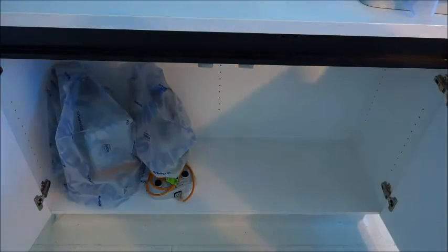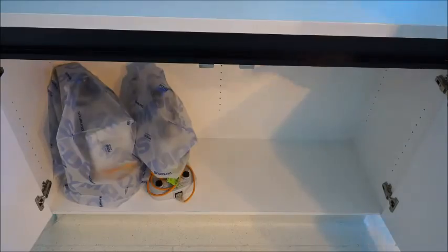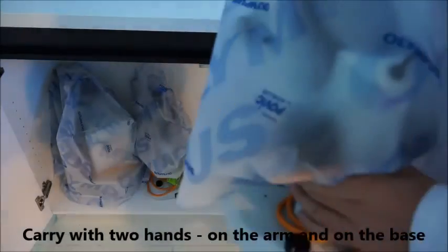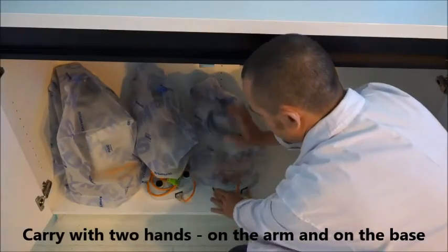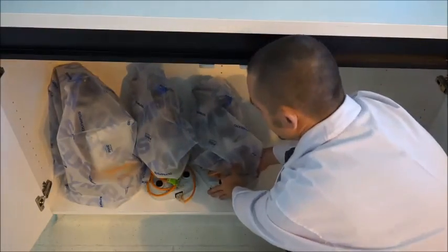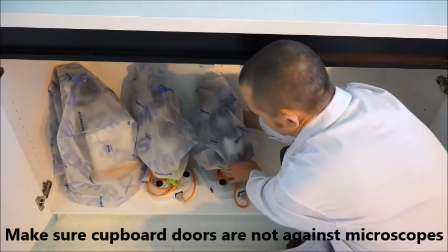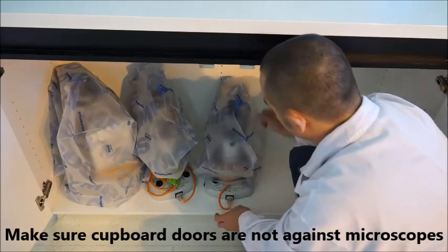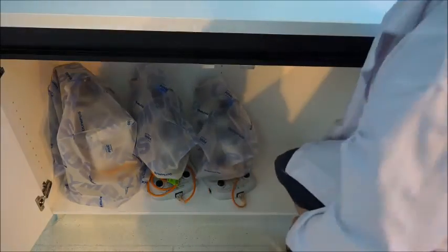One last thing: when putting these microscopes away, remember — always two hands. But when you get to the cupboard, you've got to park them at an angle. Notice how they're sitting a little bit at an angle — that's because whoever made the cupboards didn't make them deep enough. If you park them straight, then either the cord will get damaged or the eyepieces will get damaged. So just make sure you put them at an angle.